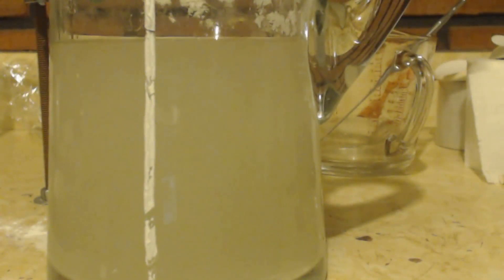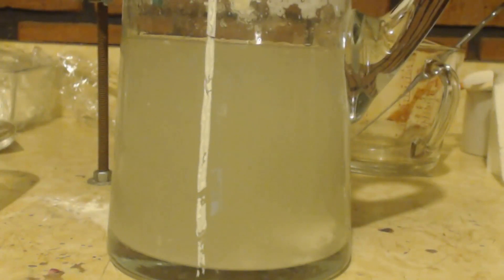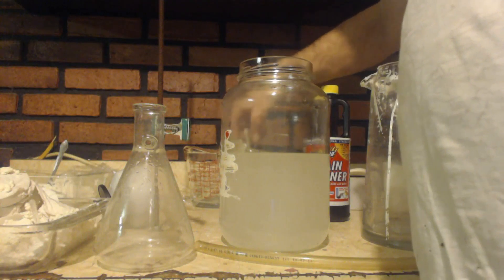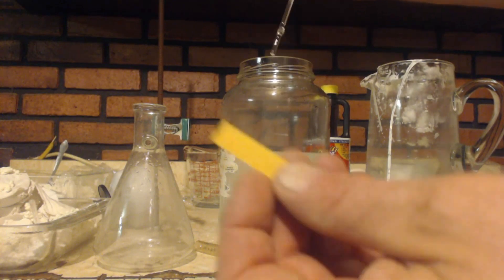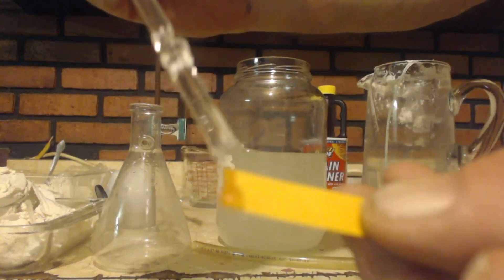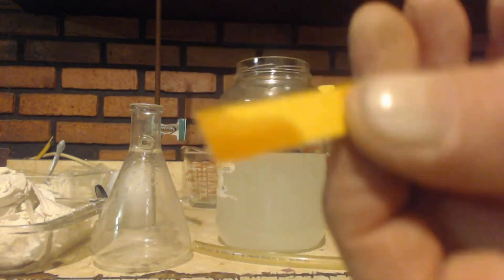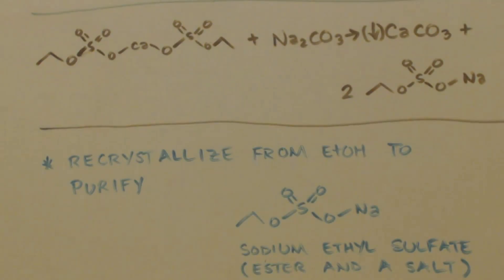I checked the pH and it's still pH one even though I put all that extra water in there. You can see the carbon dioxide when I put it in — you can see the effervescence. I'll keep stirring this up like before. Finally, I got it to neutralize. There's a pH paper — you can see it's pretty much neutral. Okay, finally, we're going to make our product.